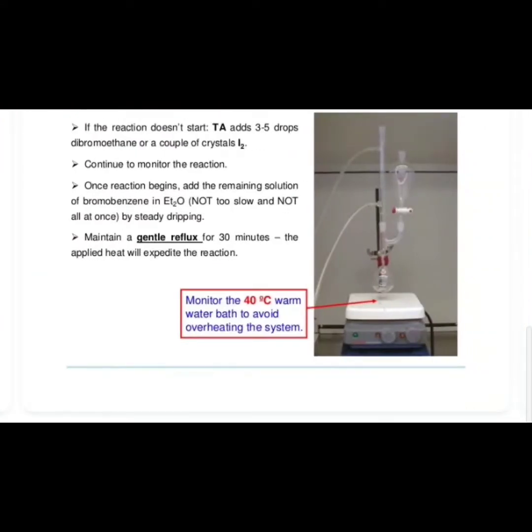First of all you will use the solvent, about 100 ml. For 100 mg, you need a maximum of 50 ml of solvent, but it must be dry. So the solvent is added first.